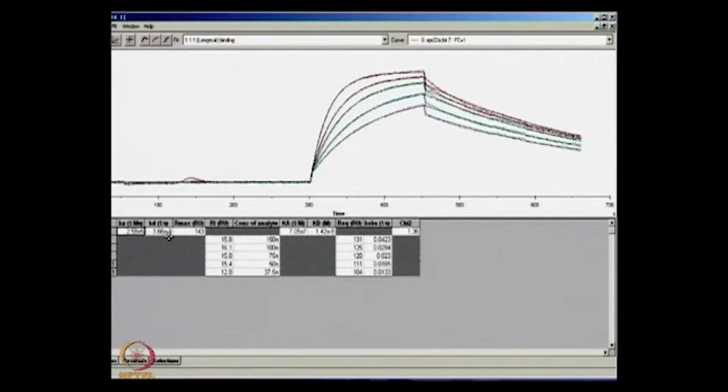So your K on and K off are displayed here. It's as simple as that. All you need to do is take a ligand, immobilize it on a chip, and run about 5 different concentrations of your analyte over the chip. If you look at the x-axis carefully, it's 0 to 600. That means the entire run was 10 minutes, and you ran 5 samples, so 5 times 10 minutes, 50 minutes, with the time taken in between the runs about another 10 to 20 minutes, about 1 hour 10 minutes, 1 hour 20 minutes, you have the results, and you have already characterized your results because you have the K on and K off calculated.